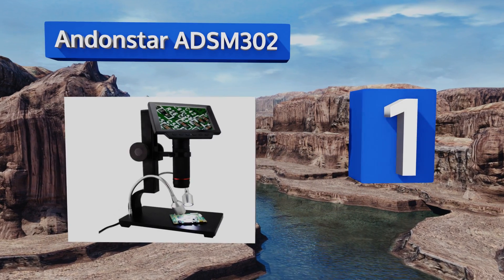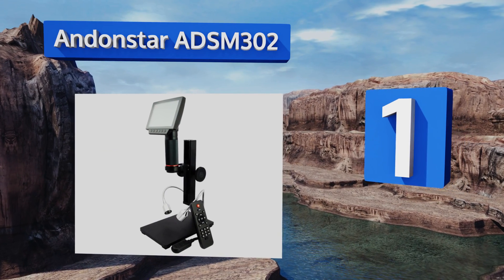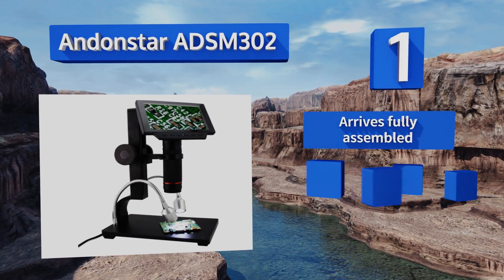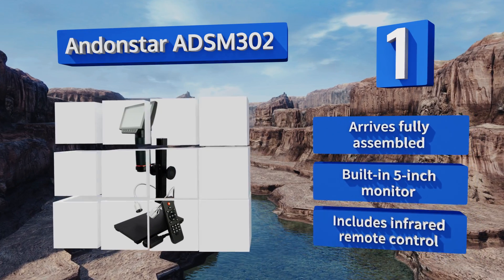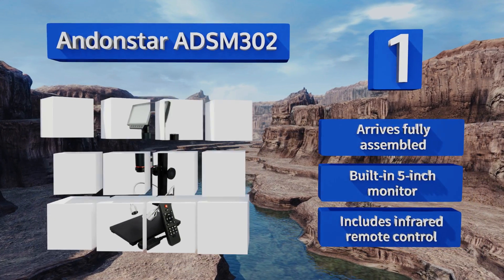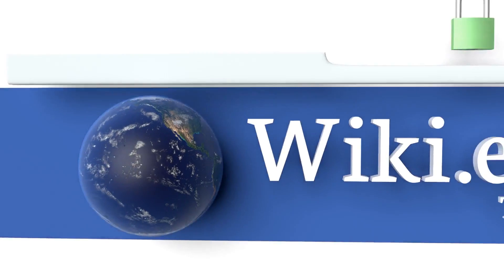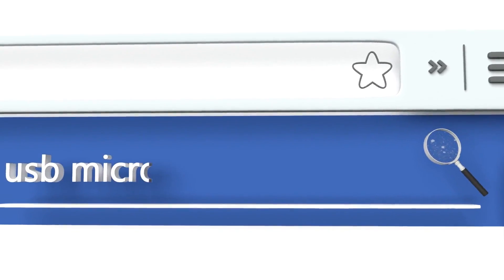Coming in at number one, while a bit pricey for most consumers, the Andostar ADSM302 boasts incredible specifications that make it well suited for anyone truly serious about looking at tiny things. It can magnify up to 560 times and is capable of recording HD video at an impressive 1080p. It arrives fully assembled with a built-in 5-inch monitor and an infrared remote control.